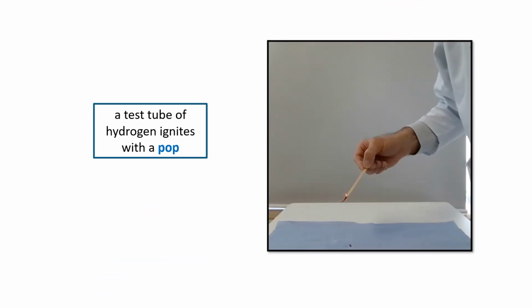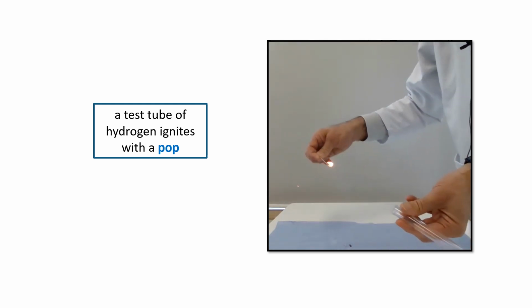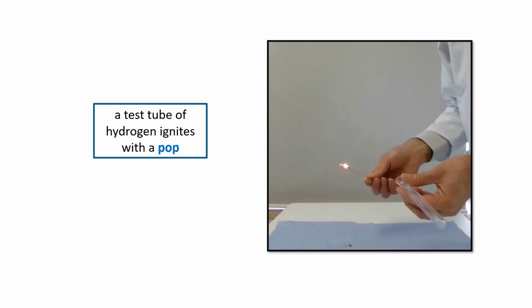So I have a flame. If I produce a test tube of hydrogen, a squeaky pop.